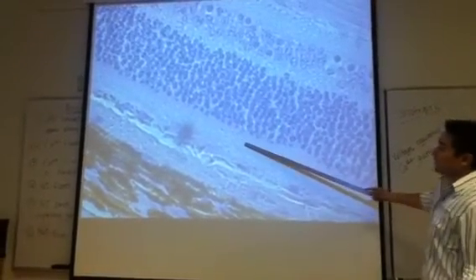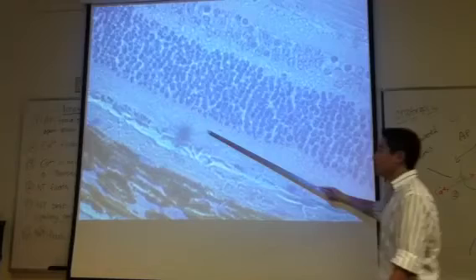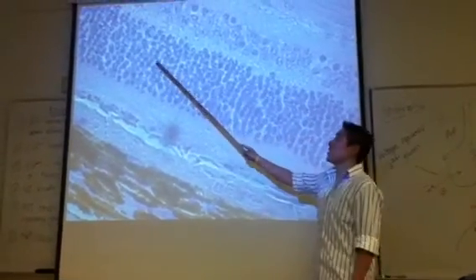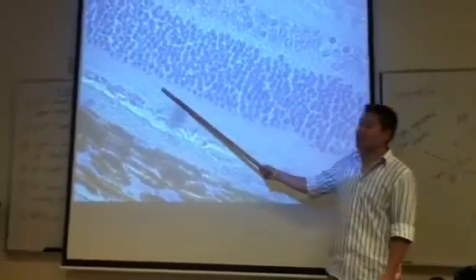So, what is this layer right here, then? Right, well, part of the photoreceptors. Okay, so what is this thick layer right here? The somas are the photoreceptors. Right, so that's the soma or the nuclei of the photoreceptors. So then if this is also part of the photoreceptors, which part is that?